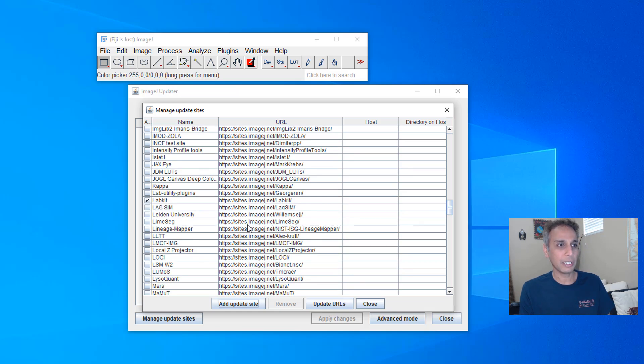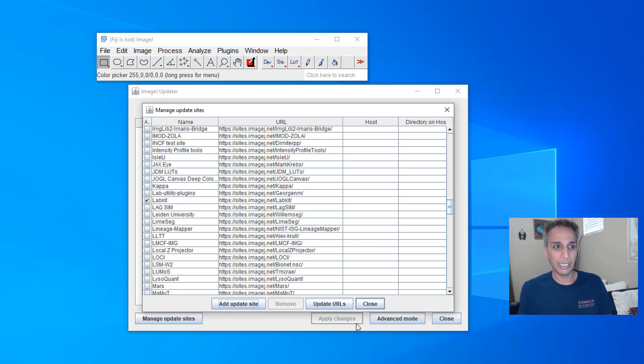So our goal right now is to scroll down to L and find your LabKit, check that box and just go add update site, close and then go ahead and apply the updates. That's it.